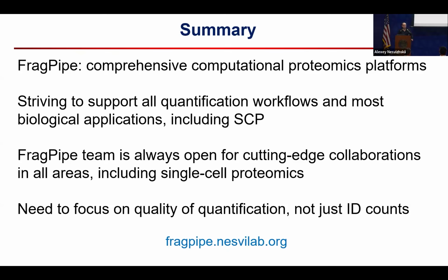I would also add to that the importance of how you post-process the data. So we had a tool, MapDIA, actually, that everyone forgot about, but that was a tool in the early days of DIA that would basically correlate fragments to each other across multiple runs and to the precursor to the peptide and even to the protein level as a way to throw away the outlier fragments and peptides that basically show discordant pattern. And as a way to find high quality fragments and use only those for quantification. Of course, there's a challenge that is actually maybe biologically relevant, isoforms and things like this, but as a filter of low quality data, that was really great.